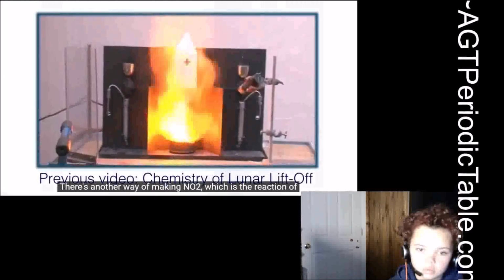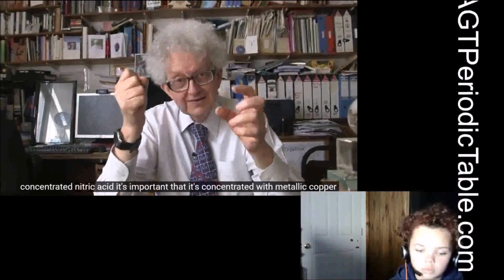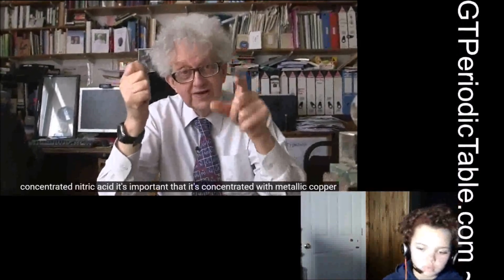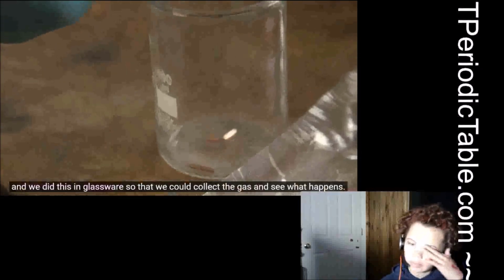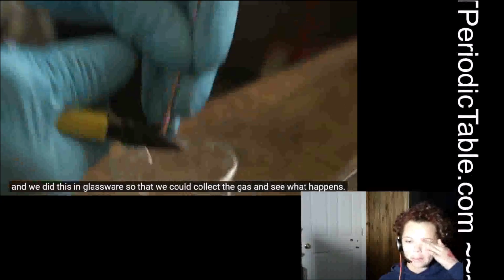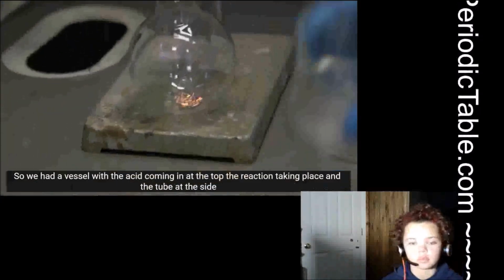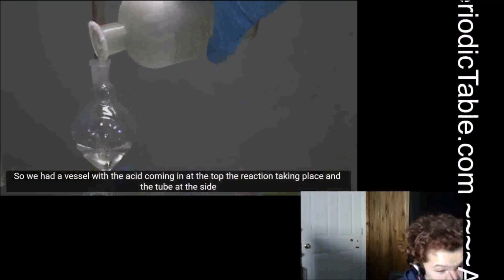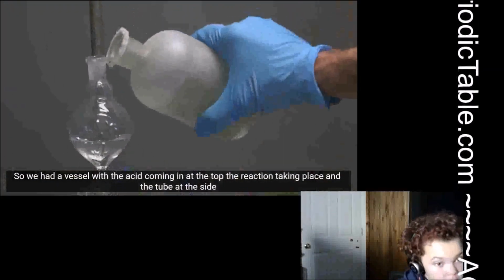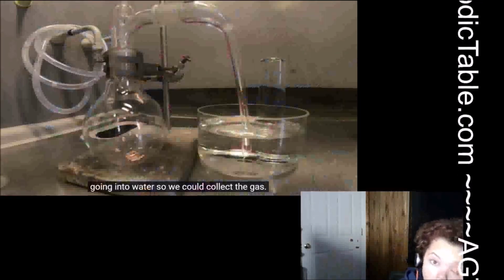There's another way of making NO2, which is the reaction of concentrated nitric acid with metallic copper. It's important that it's concentrated. And we did this in glassware so that we could collect the gas and see what happened. So we had a vessel with the acid coming in at the top, the reaction taking place, and a tube at the side going into water so we could collect the gas.